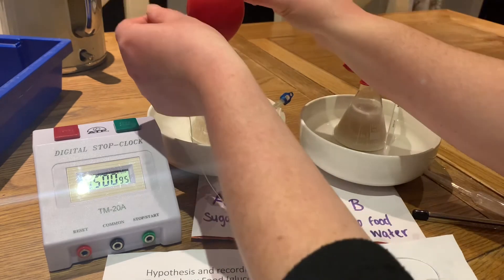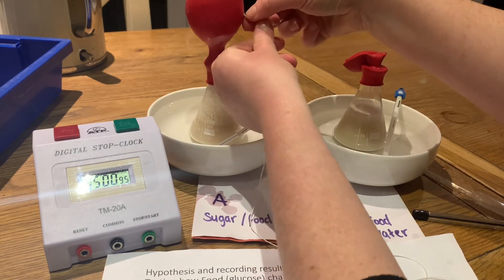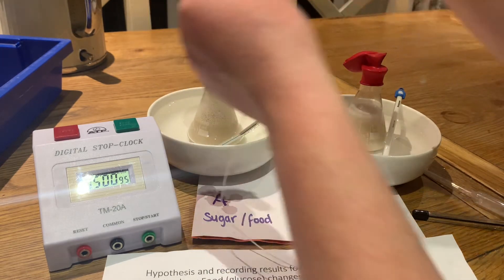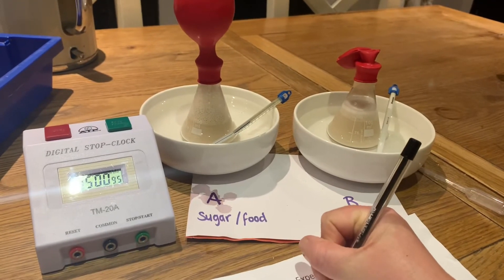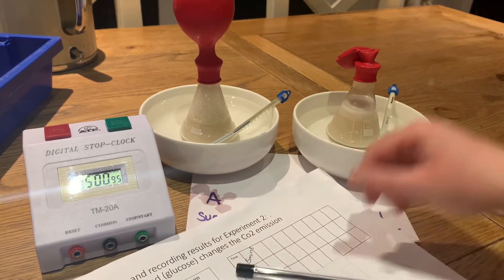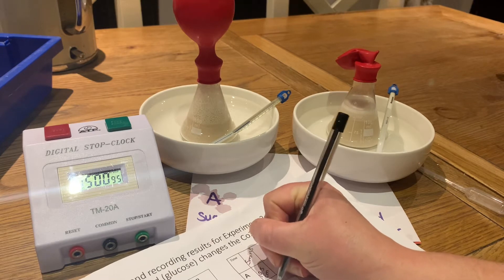I'm going to measure flask A now, being very delicate so I don't disturb the balloon. So for flask A, the diameter of the balloon is 19.5 centimetres after five minutes. I'm not going to measure flask B because I don't think it has any gas in it yet.